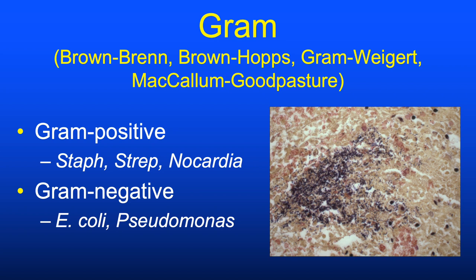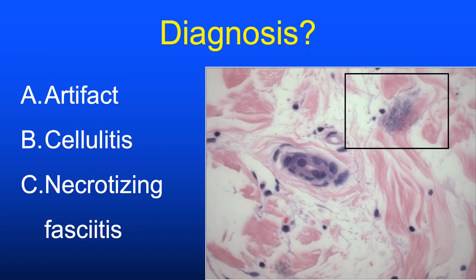Gram stains for bacteria can be somewhat subjective and subject to technical factors. Looking at this image, we see cocci that are sitting on collagen fibers a little out of the plane of the tissue section. A true infection such as cellulitis or necrotizing fasciitis would have a more diffuse infiltrate of pathogens—not just sitting on collagen fibers—so this is technical artifact. It's important to avoid overcalling infection when it's not there.